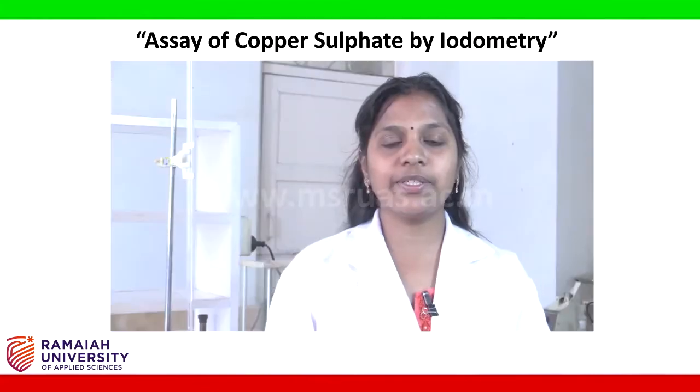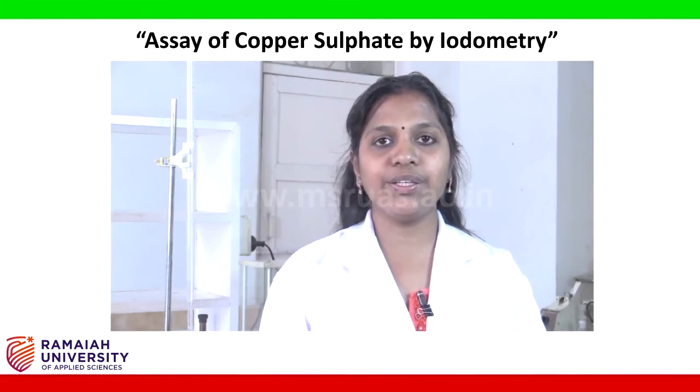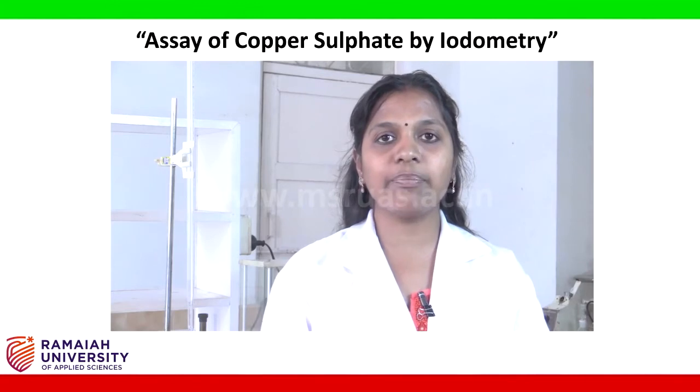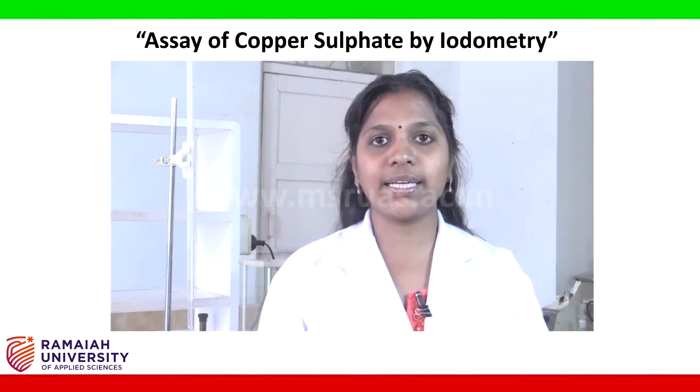To determine the percentage purity of given sample of copper sulfate, the titrant used is 0.1 N sodium thiosulfate, which is a secondary standard, and it has to be standardized by using a primary standard. Here the primary standard used is potassium dichromate. Now let us start the standardization of 0.1 N sodium thiosulfate.